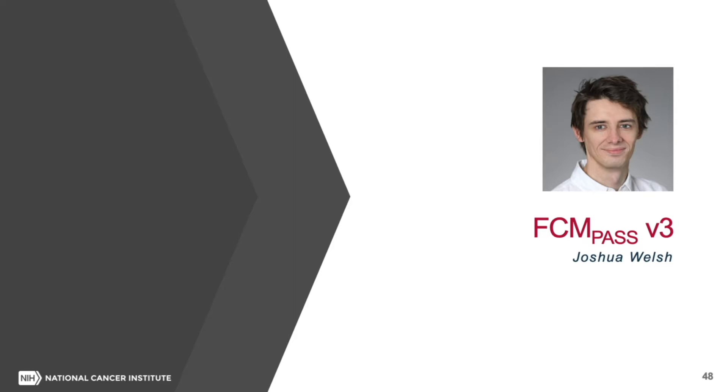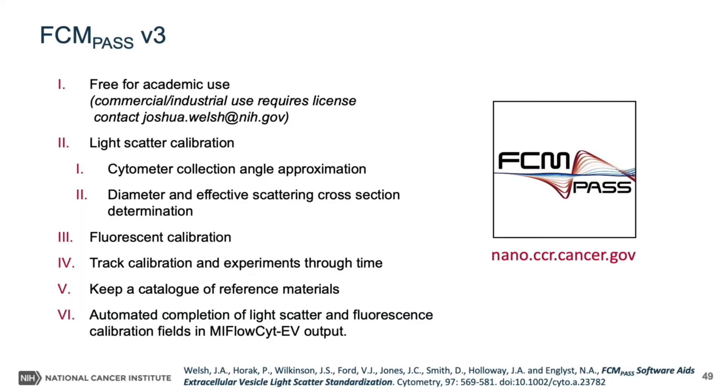Hello again. I'm now going to show you the latest release of the FCMPass software. As well as performing light scatter calibration, this software allows you to perform fluorescence calibration and create automated MIFlowCyt-EV reports of your experiment with respect to the calibration and characterization fields. One of the distinct differences to the cytometry software is that this is free for academic use and is compatible with reference materials from any source.